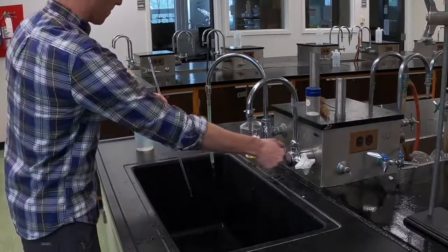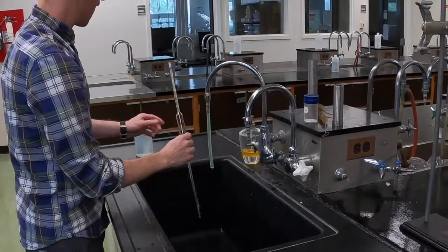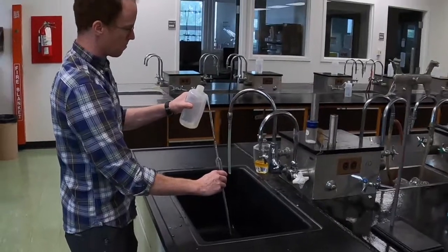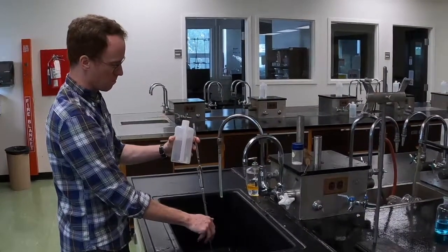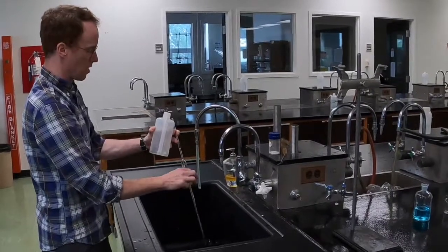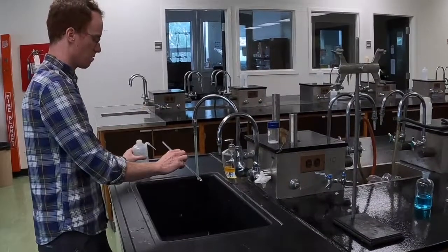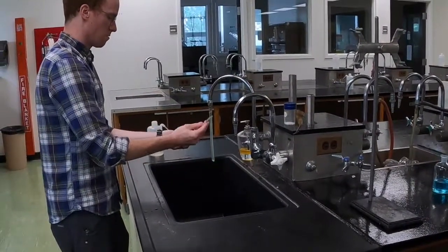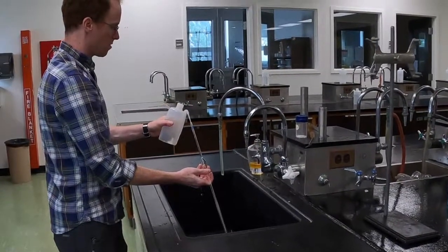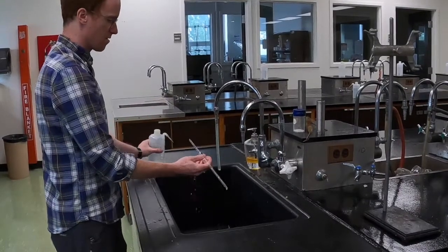Once you've rinsed all of the detergent away with the tap water, you now need to rinse away all of the tap water with distilled water. To do this, you can get your distilled water from one of the distilled water bottles that's on the bench top. You spray the distilled water into the burette or pipette until you've added roughly 1/10 of the volume of that glassware. Then you turn the glassware sideways and rotate, making sure to coat the entirety of the inside of the glassware, and then you drain. You should do 3 of these small distilled water rinses.